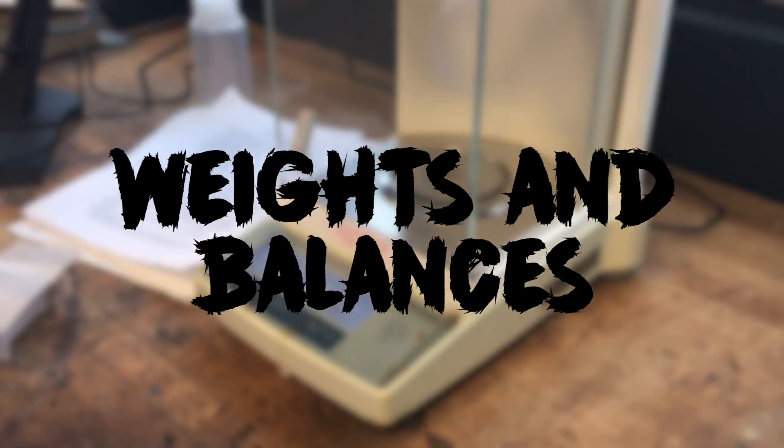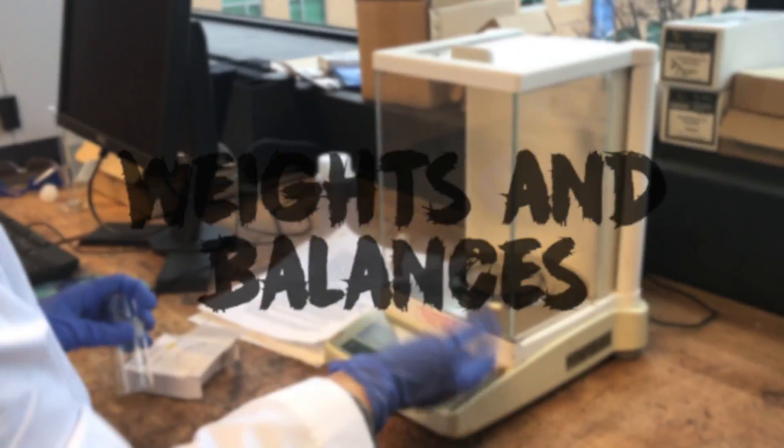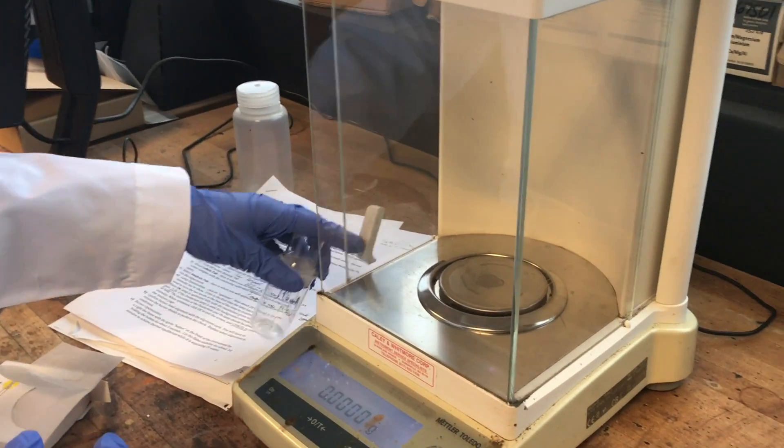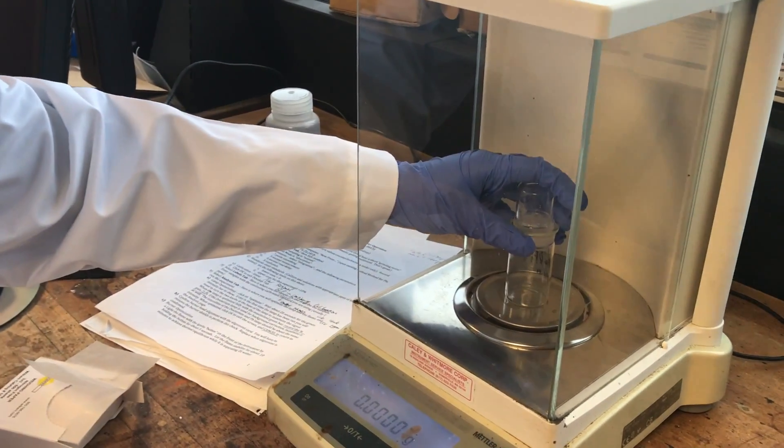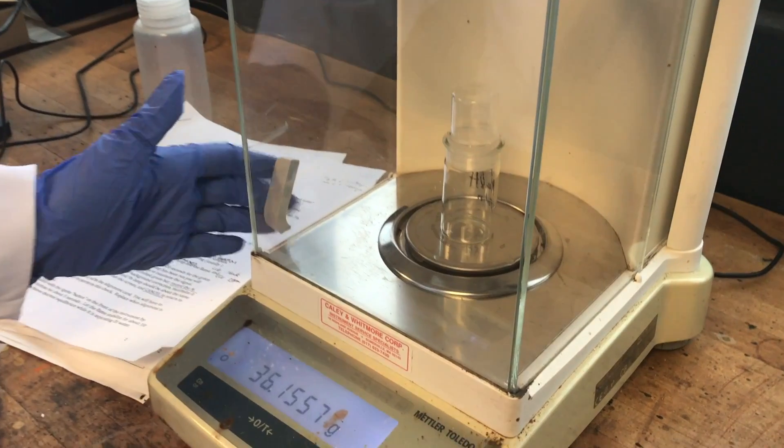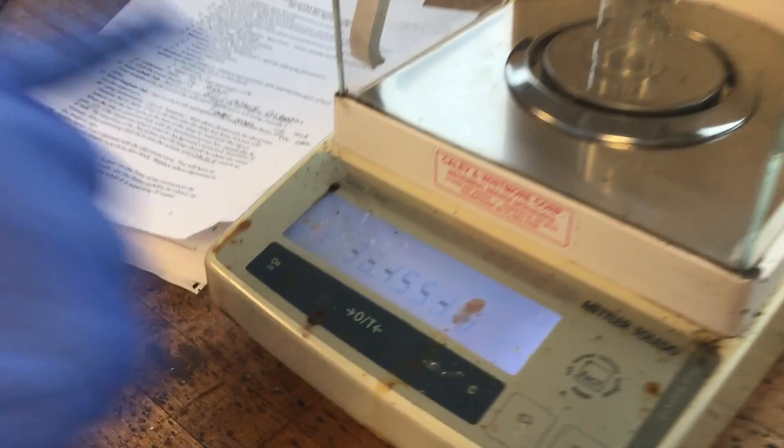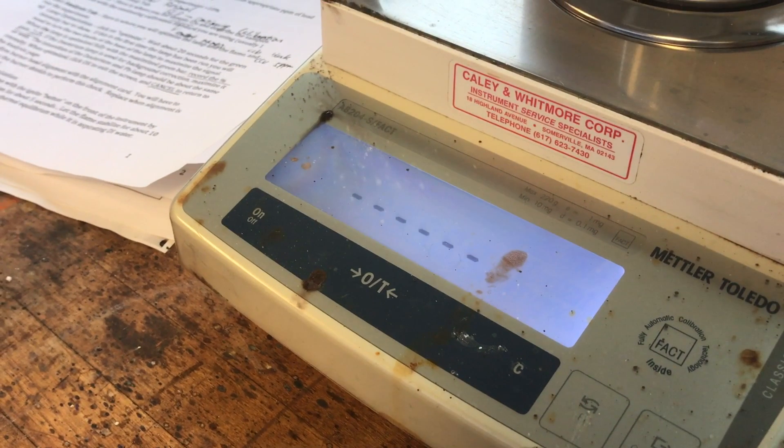And now we're going to go over how to use the analytical balance. Place the weighing apparatus on the scale and make sure the doors are shut tight. When weighing out any substance you must first tare the weigh bottle. You do this by pressing the O/T button on the middle of the balance.